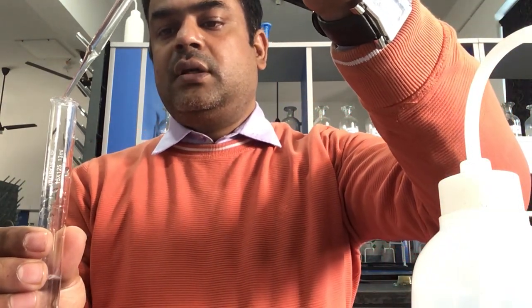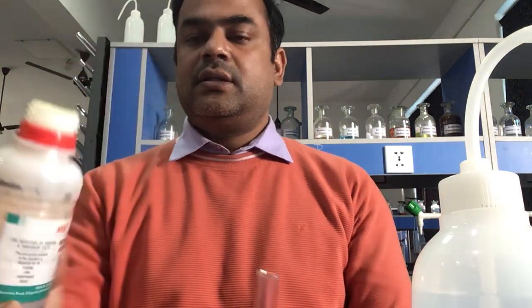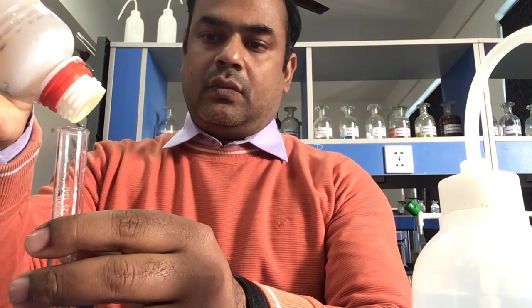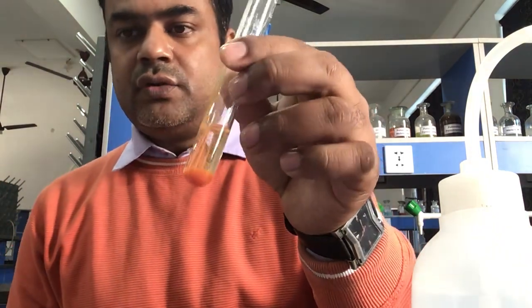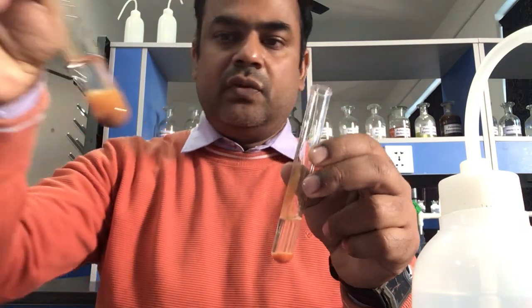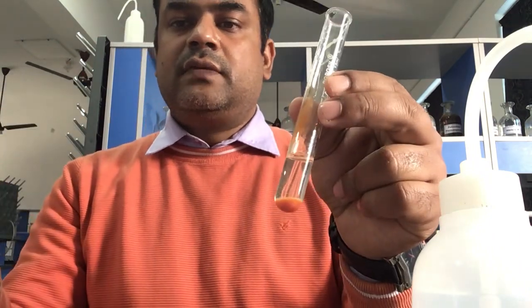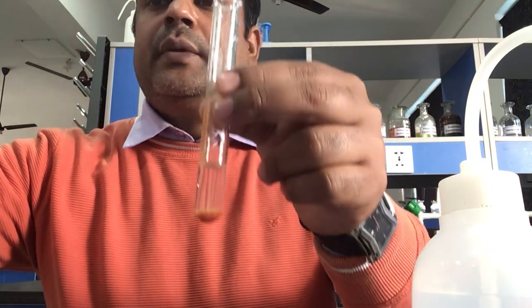Now a few drops of sodium hydroxide are added into the solution to make it basic. Then Nessler's reagent is added into this solution. On adding the Nessler's reagent, there is formation of a brownish color precipitate. It will turn completely brown after some time — you can see the brown color precipitate forming.